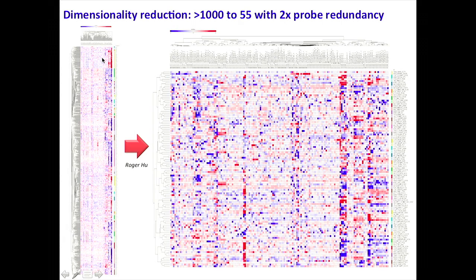And we used those highly represented sites, and we condensed this down into our P100 assay. So the P100 assay has about 96 or around 100 different phosphopeptide probes in it, and is a more compact, easy to execute assay than looking for these 1,000 things in a shotgun proteomics way.